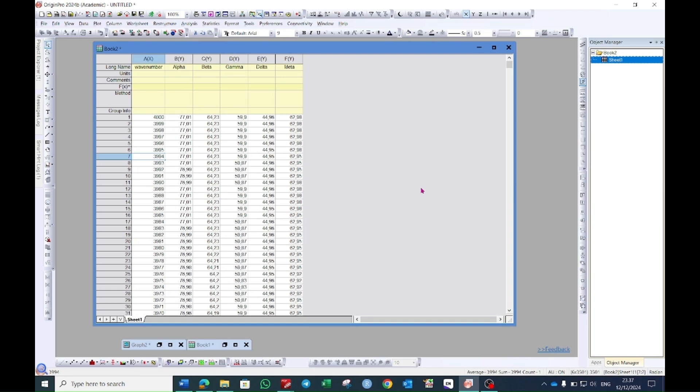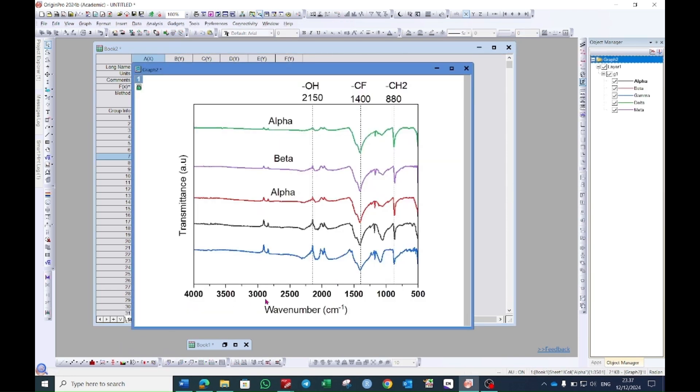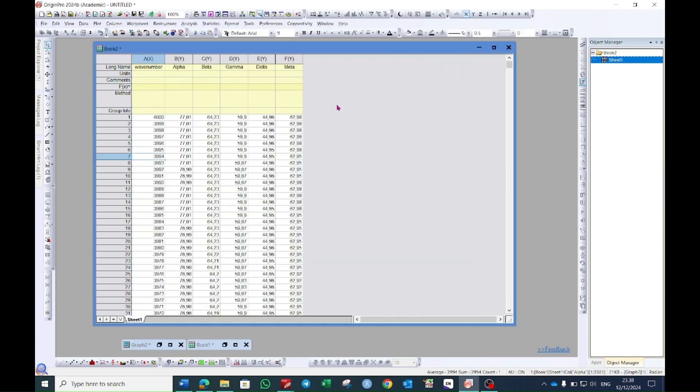Hello everyone, today I will show you how to plot the FTIR graph for your research article. My graph will look like this at the end of the video.